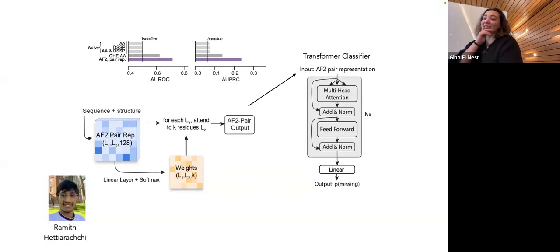Yeah, but I think Hari is pointing out that CEST data would be very interesting to account for here. It's in another time regime that we're maybe not capturing with just REX and exchange. If we could get our hands on that and see what those residues are, we'll get at least more information. Maybe not enough to train, but definitely enough to evaluate. And that would be awesome to standardize.